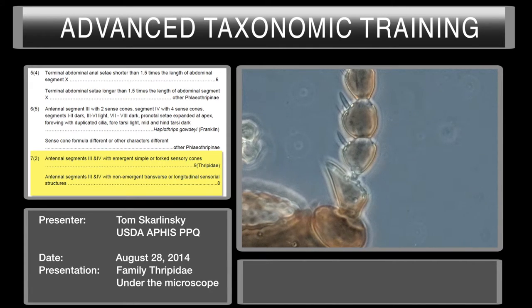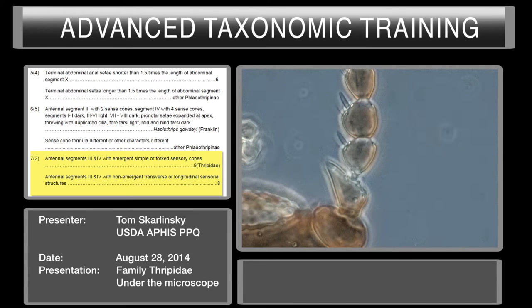You always have both sides to check. Sometimes you get a specimen that has one of the antennae knocked off. You have to be very careful — sometimes it's very difficult to see in smaller specimens. For example, some Dendrothripinae in the genus Leucothrips have very tiny forked sense cones that can appear to be simple.